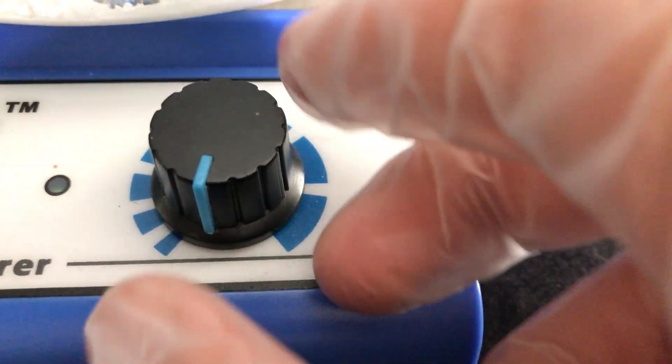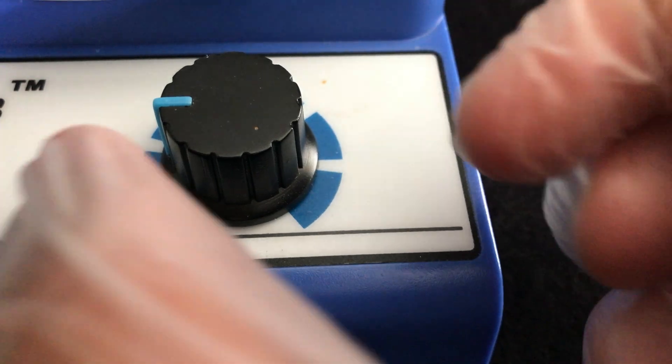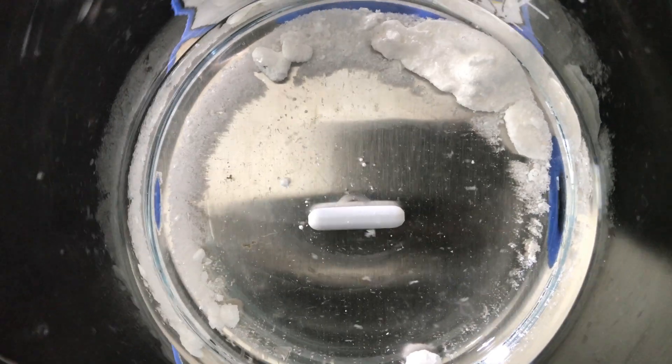The magnetic stirrer was turned on and I had to wait about an entire day until all of the mercuric chloride had dissolved.